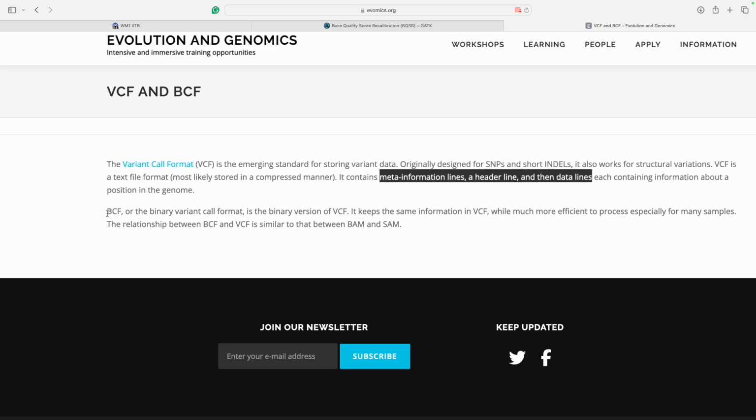BCF is the binary variant call format. VCF is a text file while BCF is a binary file. It is a binary version of VCF that keeps the same information while being much more efficient to process, especially for many samples.